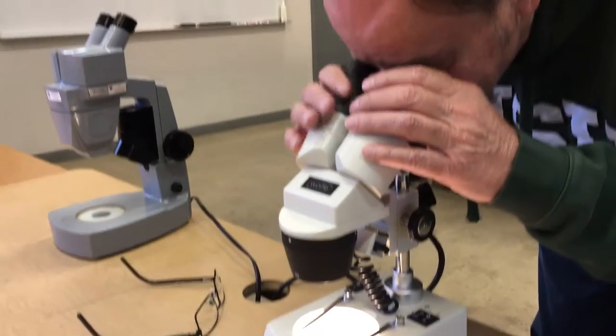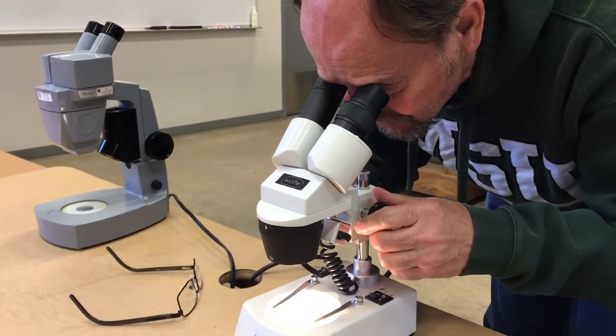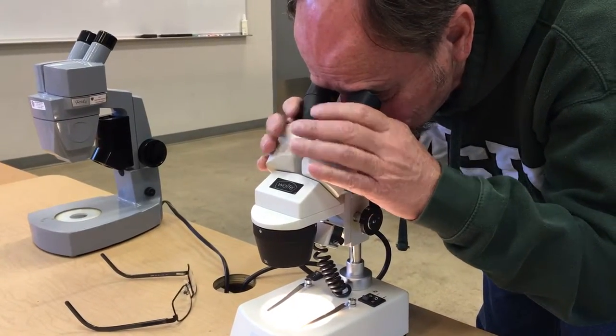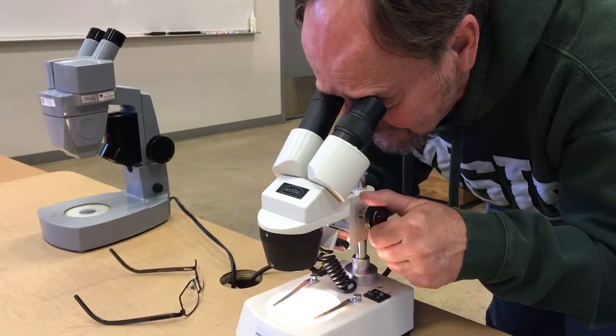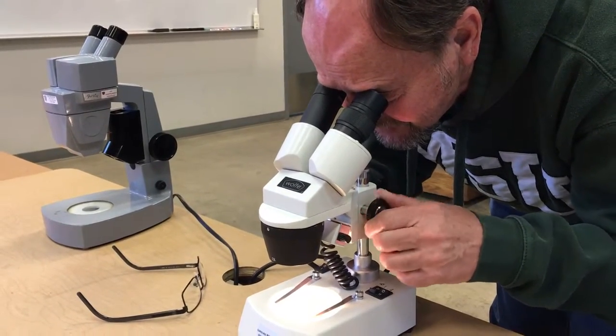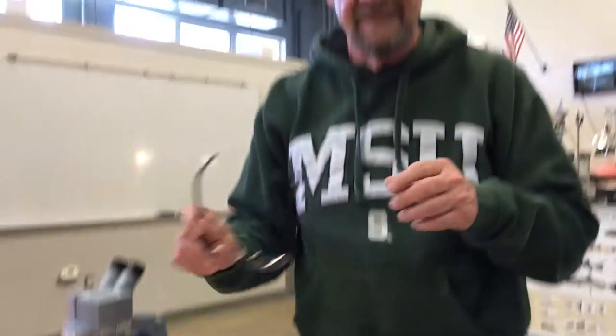Again, you want to focus and make sure you can see very clearly with both eyes, and you want to get up there close enough so that you can see very well. Then you focus, and any time you change the magnification make sure it locks — and that's really all there is to it, so hopefully everybody enjoys it.